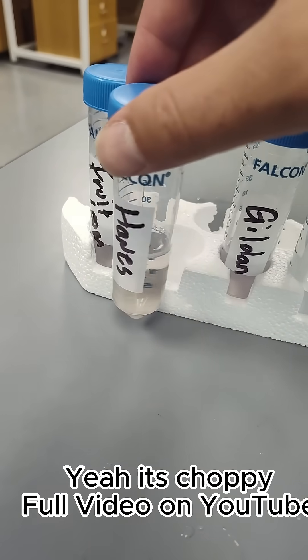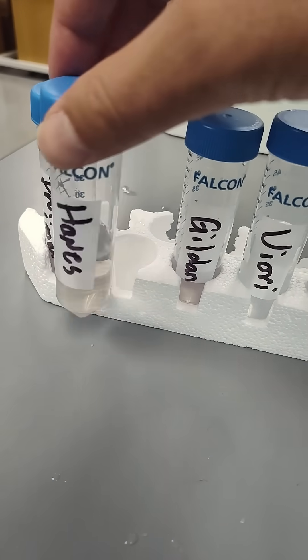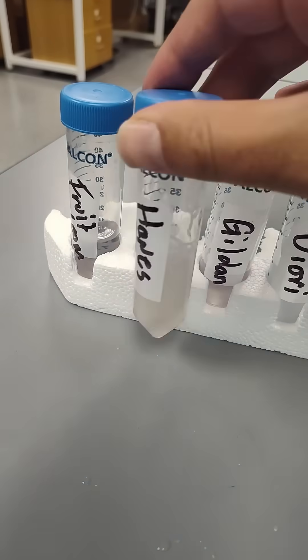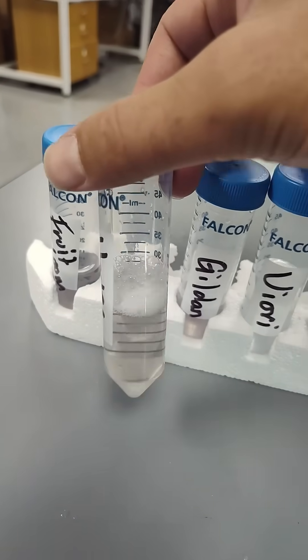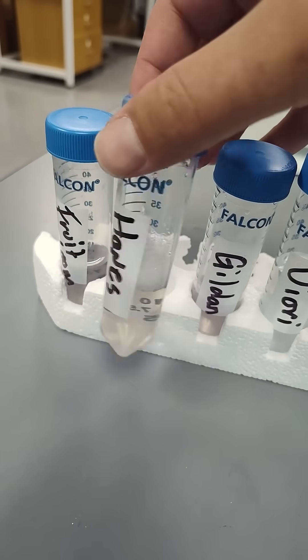Hanes has a little bit of a darker color compared to the controls - a different color than the Fruit of the Loom and the Gildan. It also has way more foam, which I'm assuming is some sort of detergent or something.